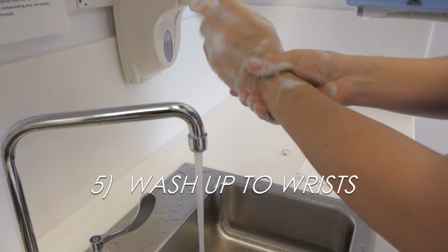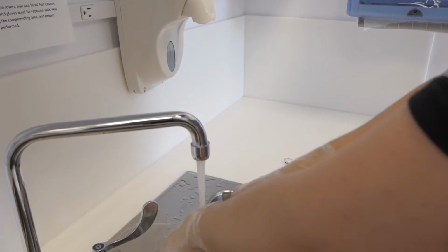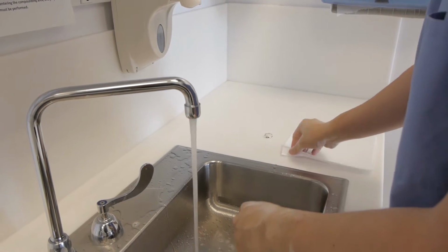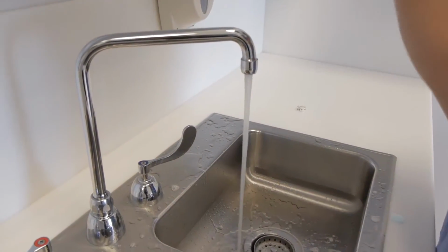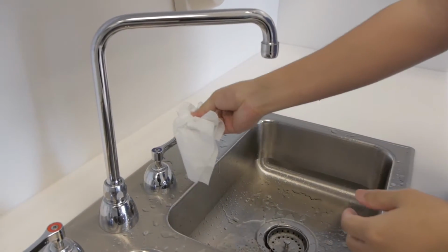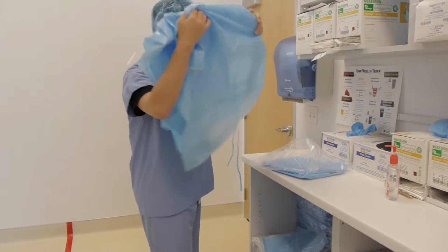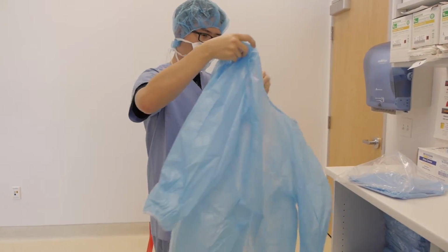Lastly, wash all the way up to your wrist. After you are done, rinse and dry your hands thoroughly with non-shedding wipes. Now put on a clean gown and apply an alcohol-based sanitizer to your hands and allow it to dry.